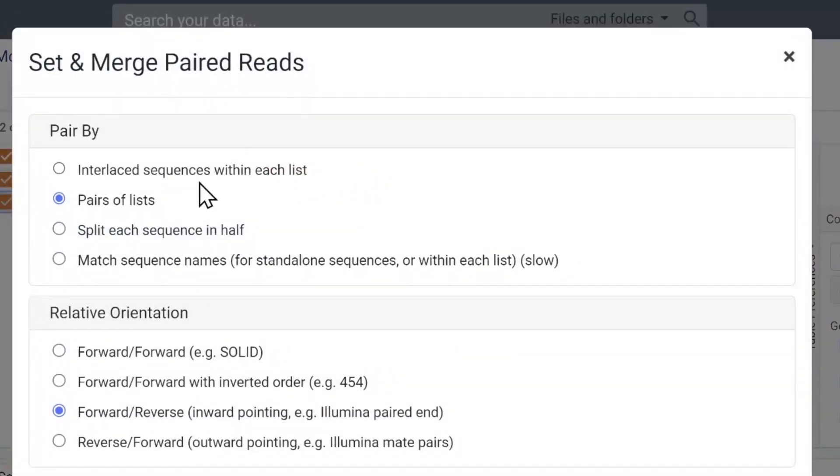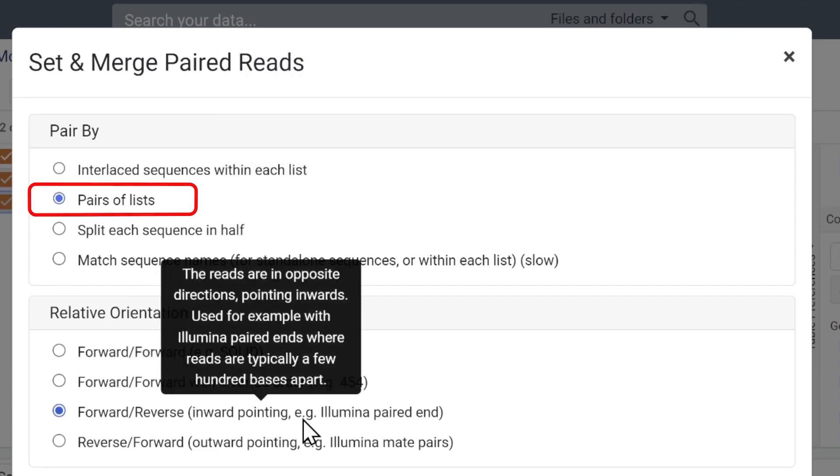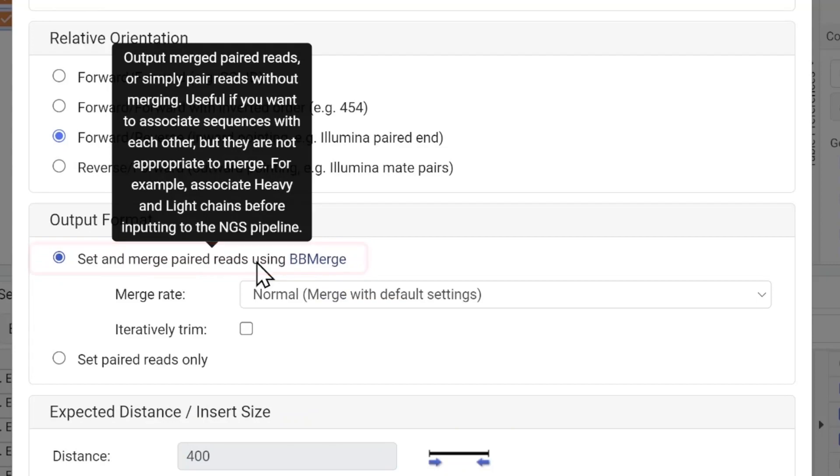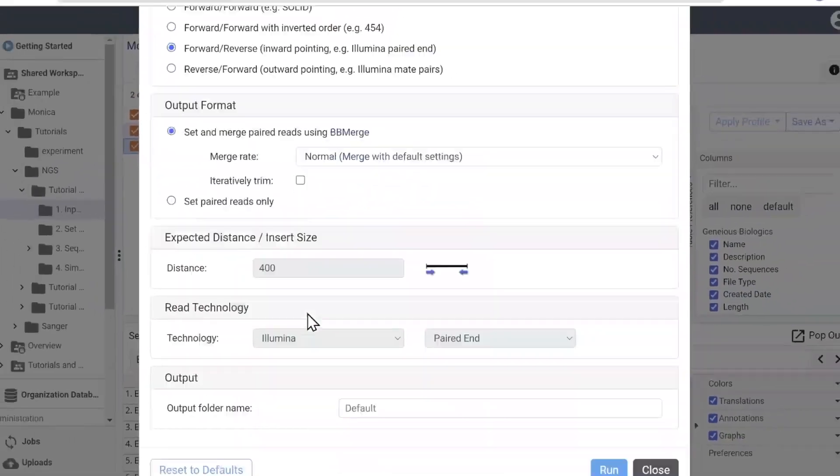Choose the appropriate file format. These are paired lists. We'll merge the sequences using bbmerge. Let's take a look at the results.